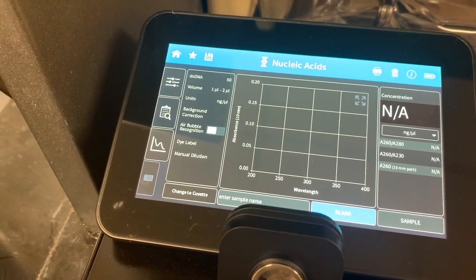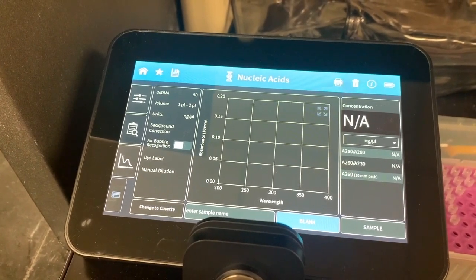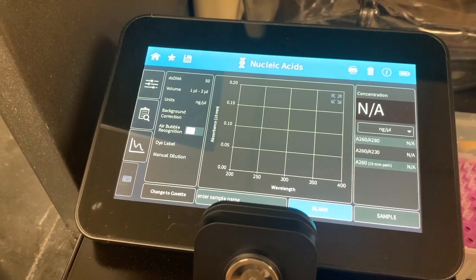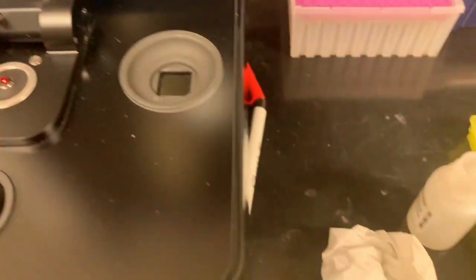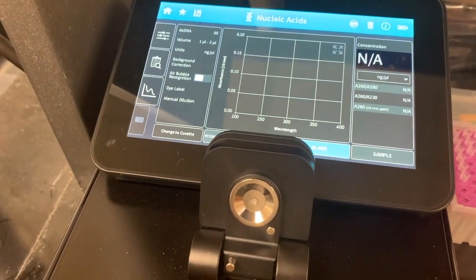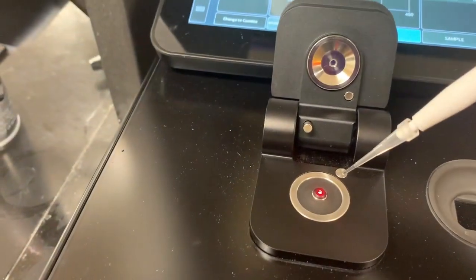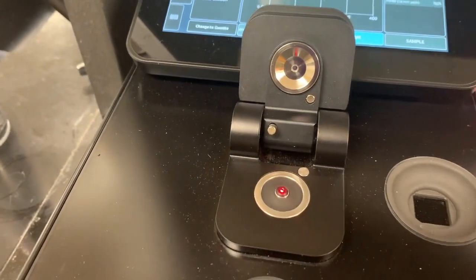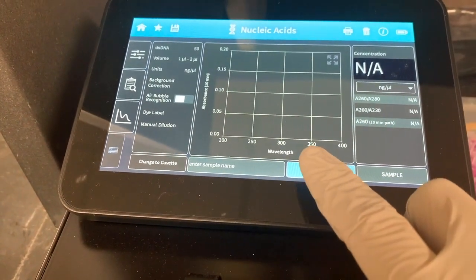And this just means adding a sample of whatever buffer you're using, so that the machine knows kind of what the solution is like without your DNA or RNA in it. So I have mini prep samples, so I'm going to use my elution buffer here. That's my samples there. And I'm going to take a 1.5 microliter sample of the elution buffer. And then I am going to, this is hard to do, pipette it directly onto that pedestal. I don't want to add any bubble or anything, but I want to get the solution onto that pedestal. I'm going to close it, and then I'm going to hit blank.